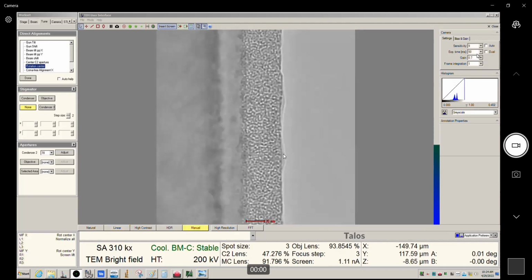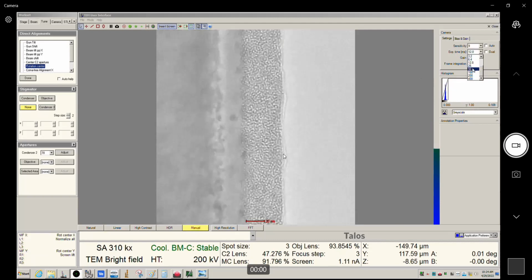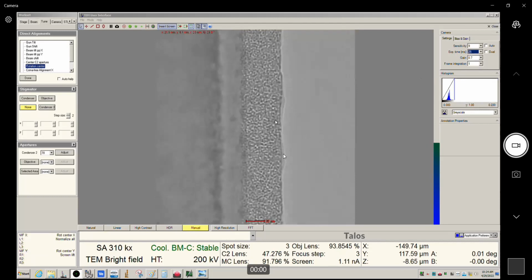If you uncheck this, I'm going to make this a little faster here. Okay, so now you can see it a little bit cleaner. Usually once you go above 50, the rate is a little too slow to do normal stuff. If you put this at like 200, for instance, you really can't do rotation center with something like that. It's too slow. So anyways, all right.